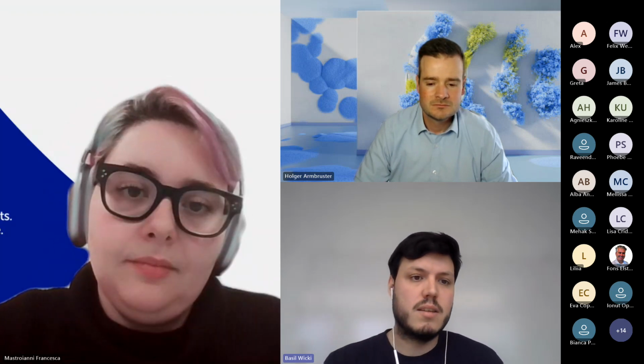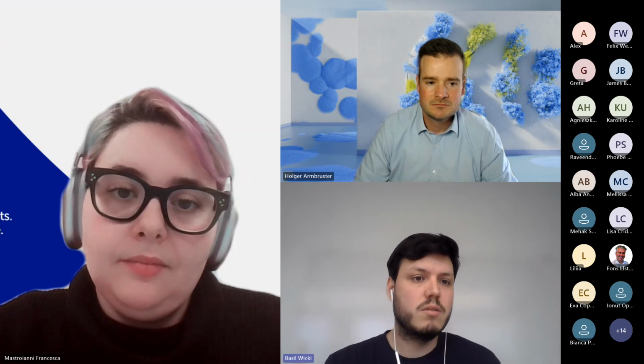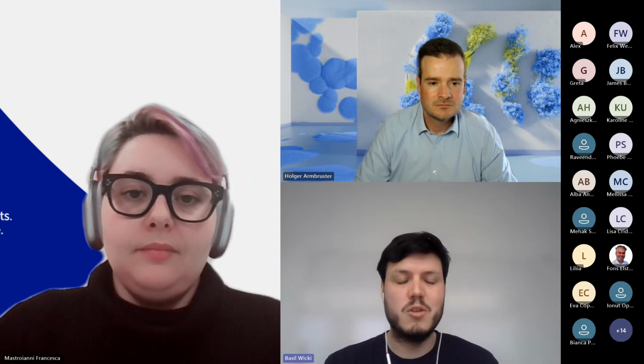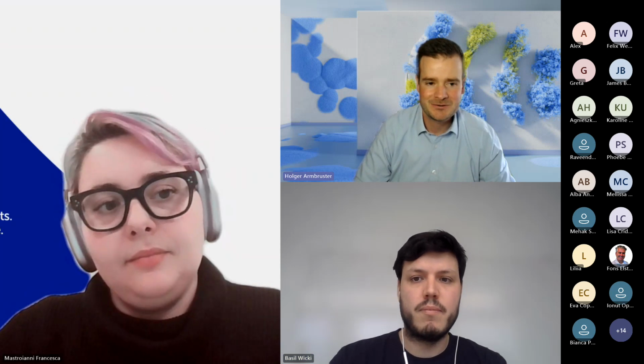Obviously, the sedimentation of the bacteria is probably the main problem to clogging, so it has to be homogenized, and you need to be a little bit faster than with compounds generally. Yeah, great insights. Thank you so much.